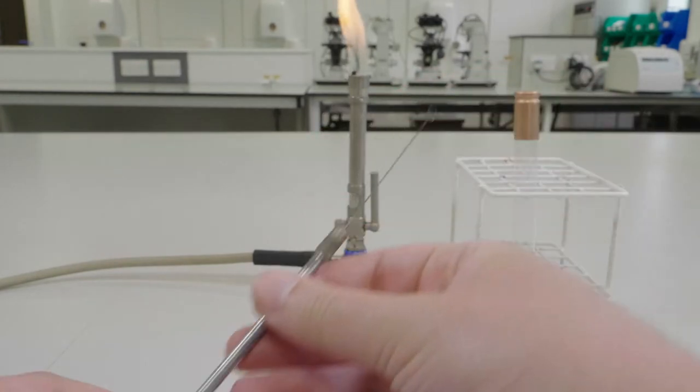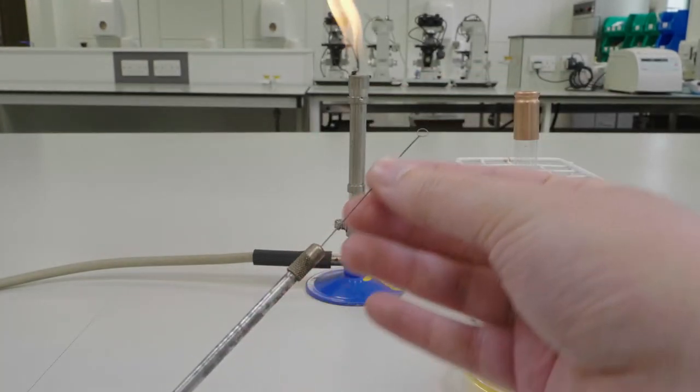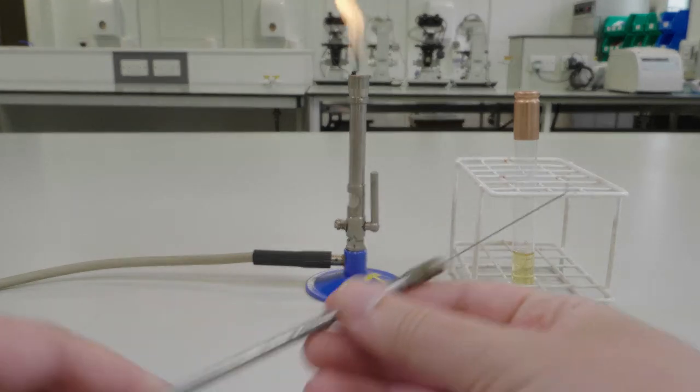Before working with it, make sure the wire loop is straight by running it between your thumb and forefinger.